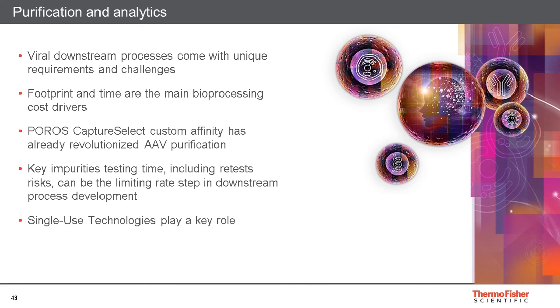So really, in that purification and analytics space, it comes with unique purification challenges, right? Many suppliers' portfolios for purification were not necessarily designed for virus purification, more like legacy mainstream applications such as MABs.